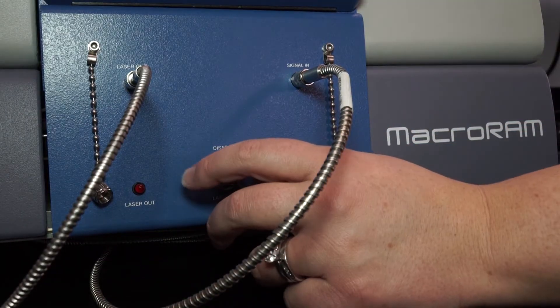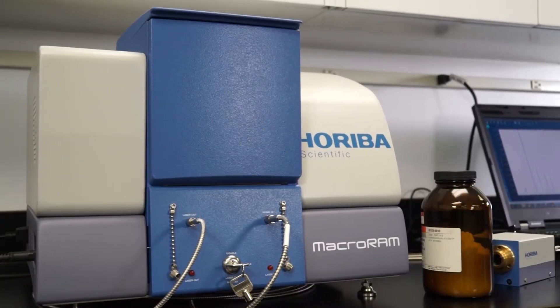Designed with Class 1 laser safety, the MacroRAM can be safely used by anyone.